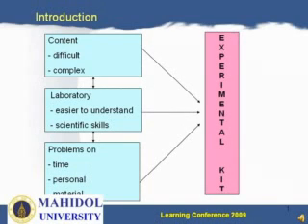Normally, teachers have to teach science contents which are difficult and complex, so they have to teach laboratory for students. The laboratory helps students understand more and practice science skills. There are many obstacles to introducing experiments in the classroom, such as the time and personnel required to prepare chemicals and equipment, and the time-consuming work and cost of purchasing chemicals and glassware. For these reasons, I can solve the problems by using instructional experimental kits.